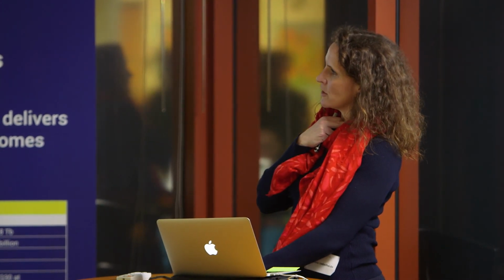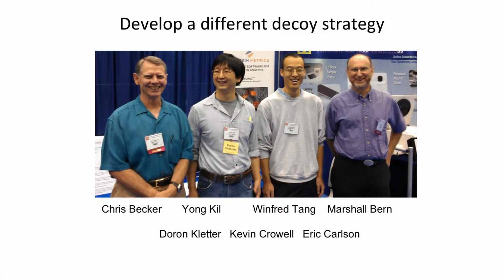And the second part of the talk is what I'm working on, antibody sequencing, but I'm just going to skip over this because it's getting late. But we sequenced antibodies of patients that are HIV infected or have malaria, and we can characterize their antibodies. And I just want to point out my colleagues, they write the software for sequencing HLA peptides and also these antibody peptides that are not trivial and not the usual proteomics data set. And they're just down in San Carlos, so they're just 10 minutes away from here.